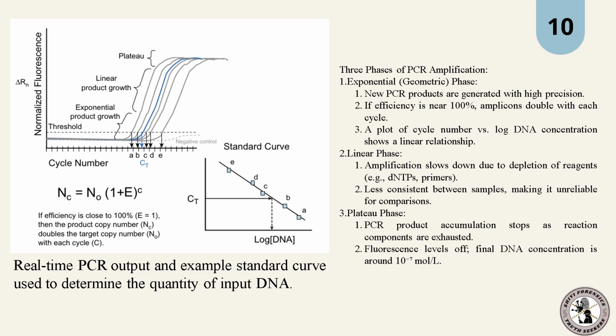So what we do is basically neutralize that fluorescence and those PCR products and create a baseline. Afterwards, the cycles continue and the fluorescence shown is significant enough, and then the graph starts to take form.